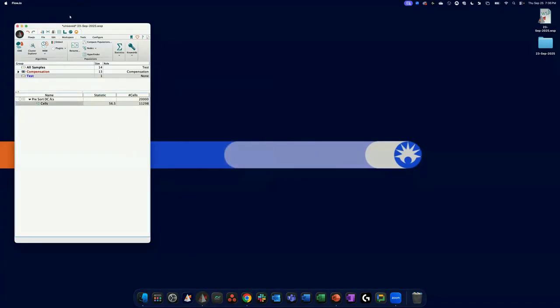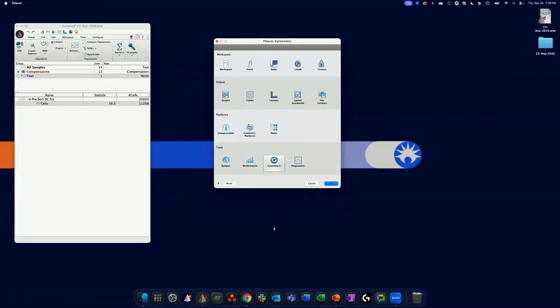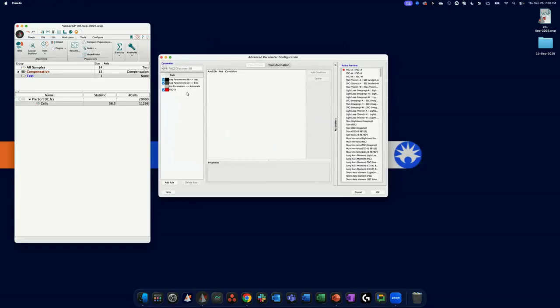So how do we make those default rules? Well, that'll be back here in the preferences. If you hit that preferences button, we go into cytometers. Here there's an opportunity again to go back to that Discover platform. Here at the bottom, advanced rules. When you click that button, this is where we can start creating rules for this platform. You can see it's even reminding me which cytometer I'm using. If I want to add a rule, I can create a rule. Let's say this one, I'll call it eccentricity, perhaps. So it's letting me rename it.